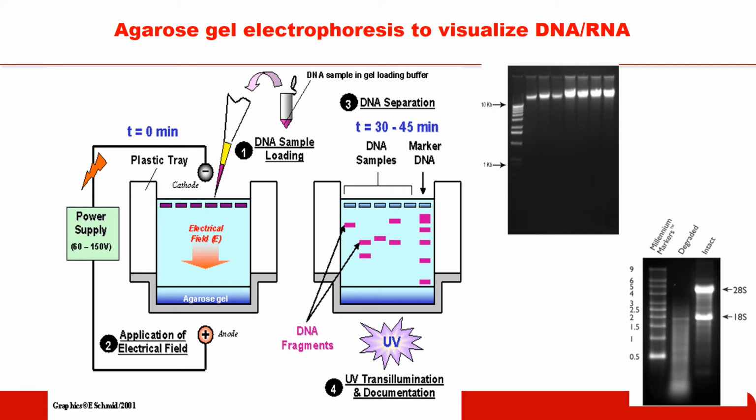Under the UV light, DNA fluoresces orange, but when we capture the picture, we see a black background with white lanes which represent the DNA. Researchers are unable to tell the size of the DNA extracted, therefore they run a molecular marker which looks like a ladder. Each little band has a specific DNA size, so from this band we can tell the size of the DNA. Also, researchers like to look at the integrity of the extraction.